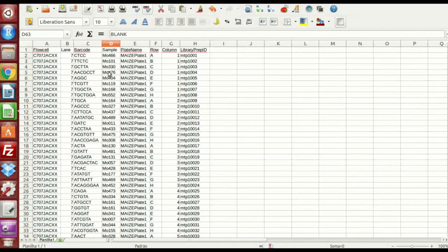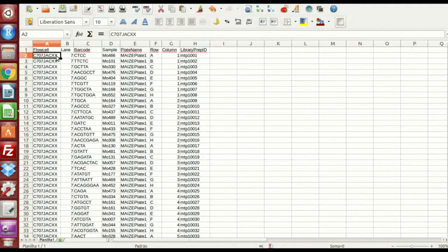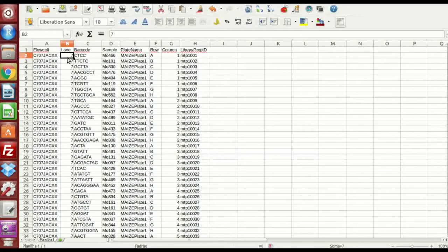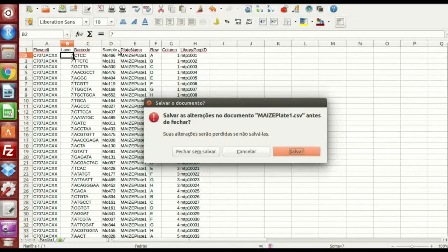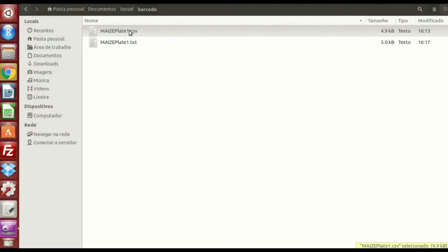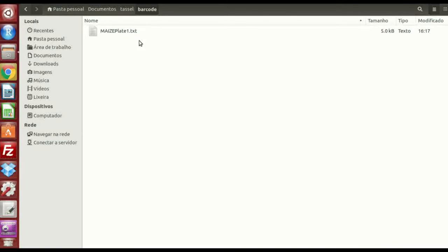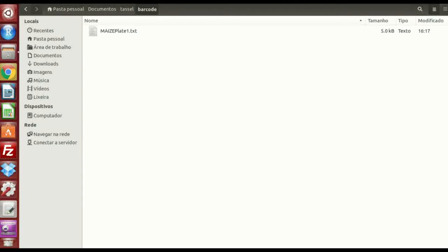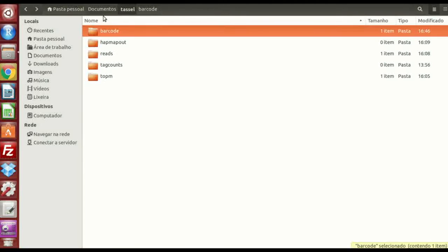But, the problem is, how can I know my flow cell name and my lane number? The first thing to do is, I'm going to raise this, I'm just letting the text file inside the barcode file.